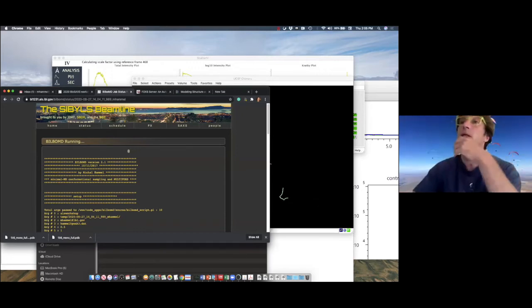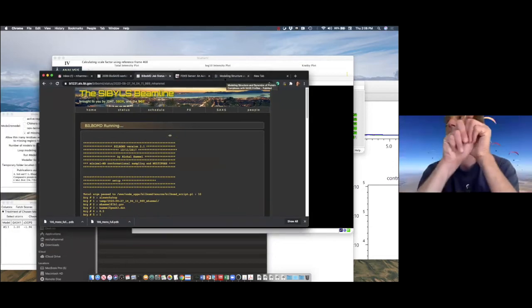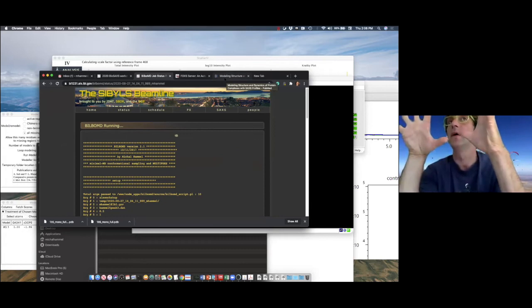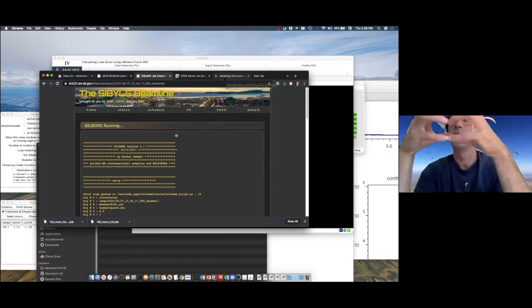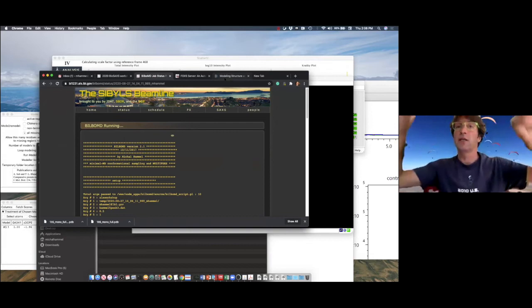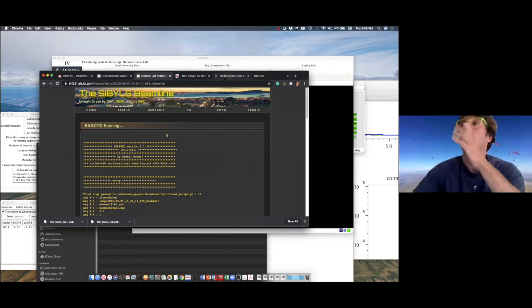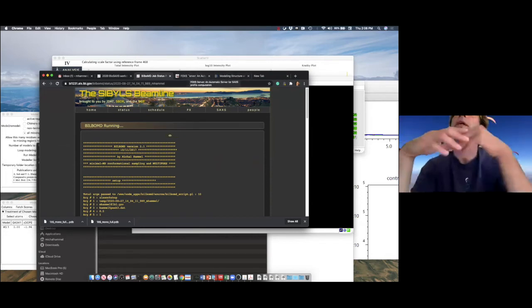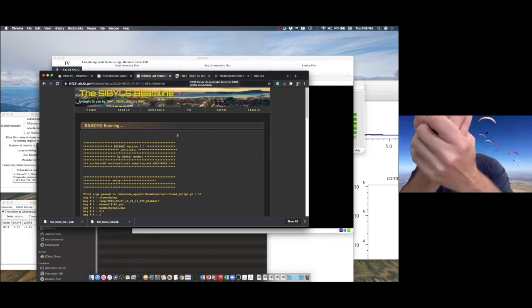BilboMD allows multiple domain motion when you have, let's say, domain A and B connected with a linker, or you have a dimer of something, and then extended domains from the dimer. So you can do complicated systems that can move around, and Modeller is only adding those missing pieces to the structure that you have. You can do it in Coot.